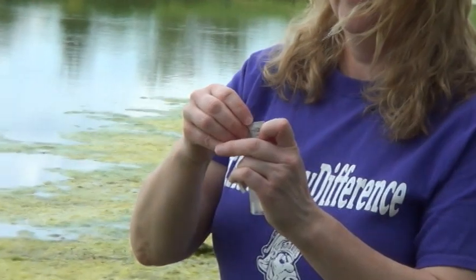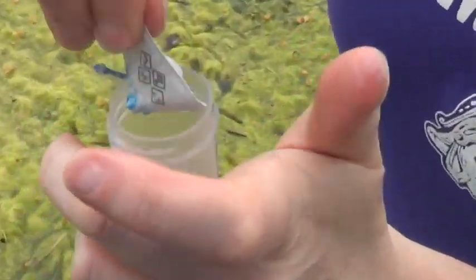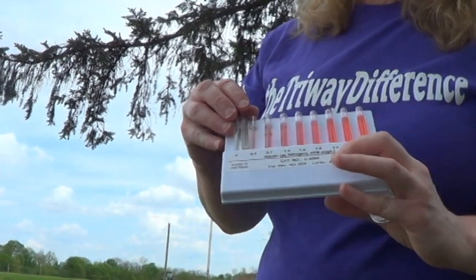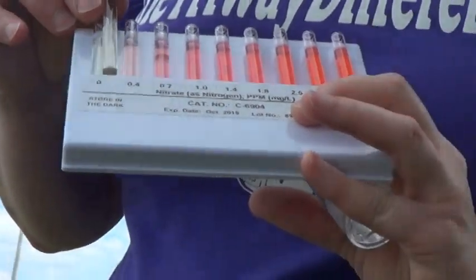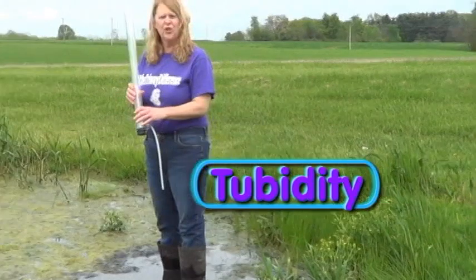So I'm going to take this pack. So the first thing I need is 15 milliliters of water. I'm dumping the contents into the container. Shake for 3 minutes. If you have any nitrates in the pond or stream, it will turn a shade of pink. As you can see here, there's no nitrates in this water. We're going to measure turbidity.